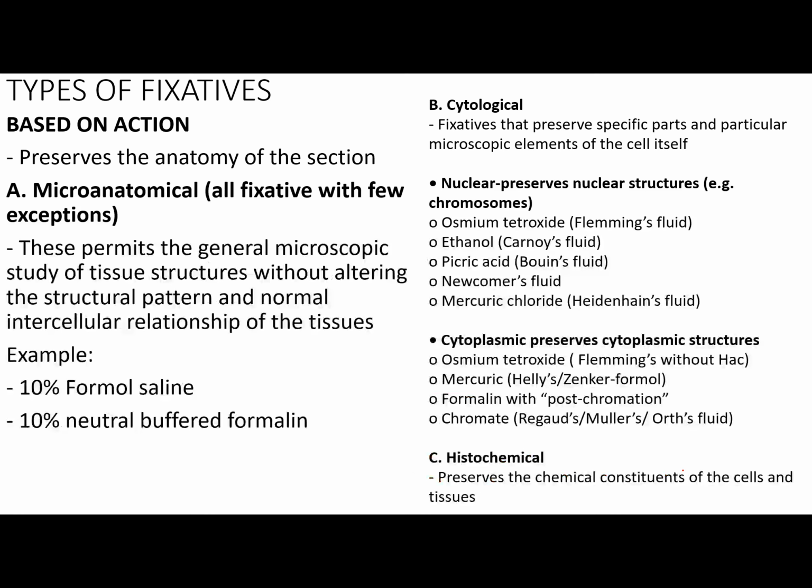Now let's go to the types of fixatives. Now there are two major types of fixatives, class.